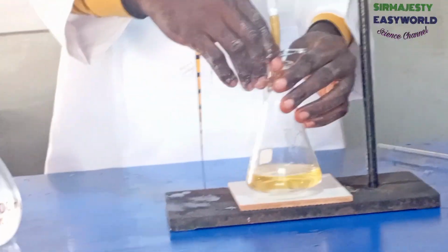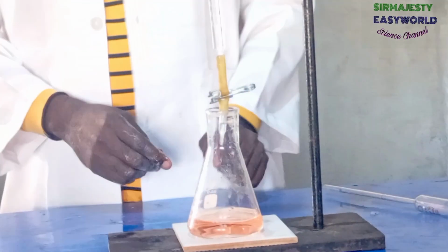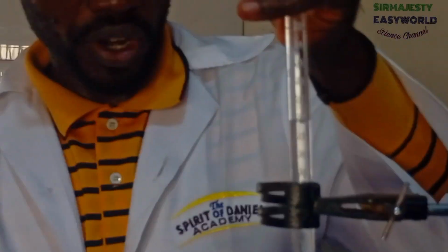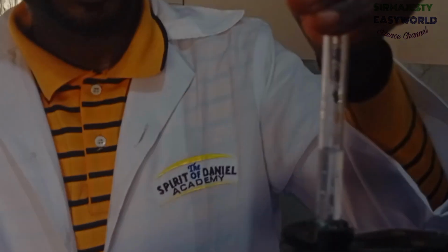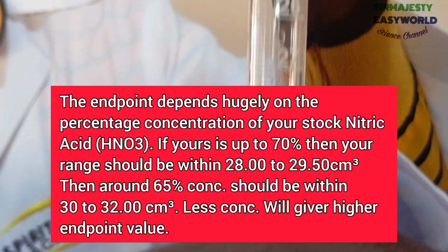How many marks? I think we are close to the endpoint, and we are there. So, our reading is, this is really camera. This is 28 or 27. Which one are you seeing in the camera? 28 or 27.9. Which one? 28. Okay. 28.